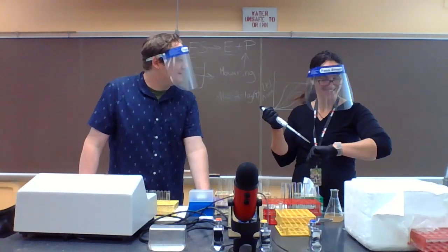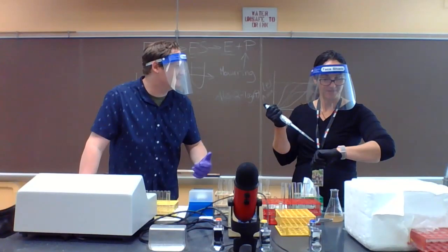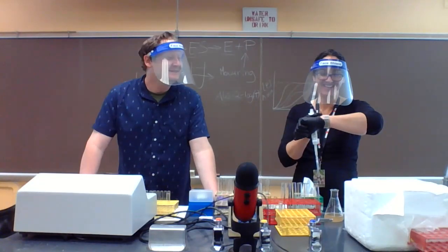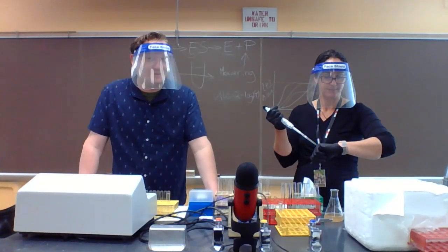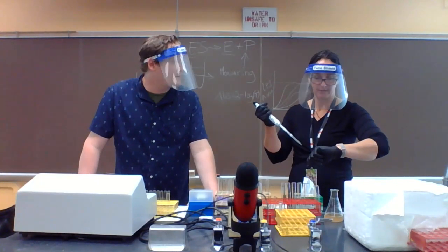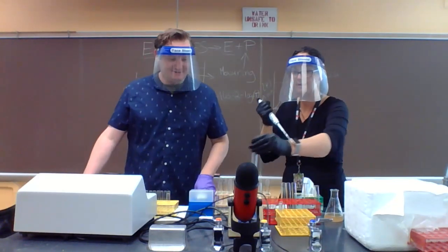And this is usually a very stressful lab for people, but with our vast experience, a minute feels like ages. One fun tidbit about this lab is when we boil the enzyme or the potato extract, it does usually make the room smell like poorly prepared French fries. Mm-hmm. So okay, it's always fun. We're right there. Cool, cool, cool.